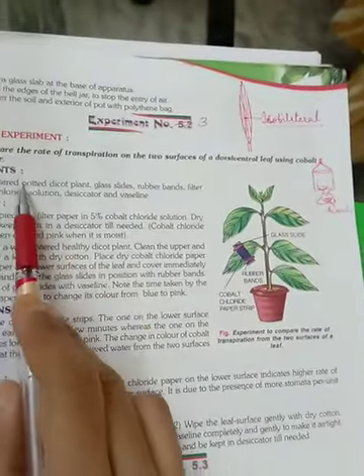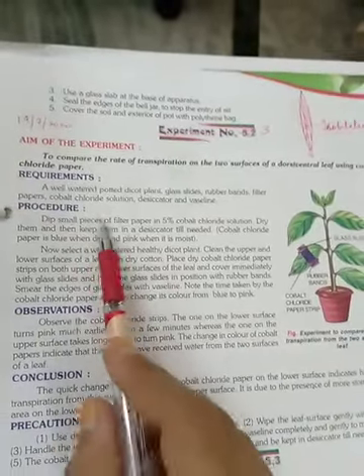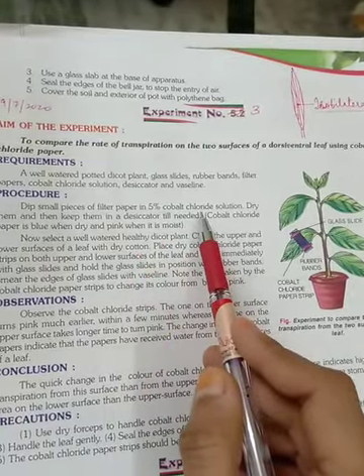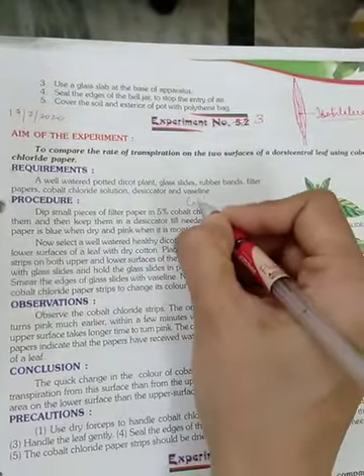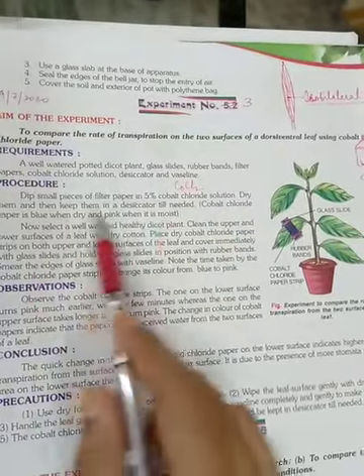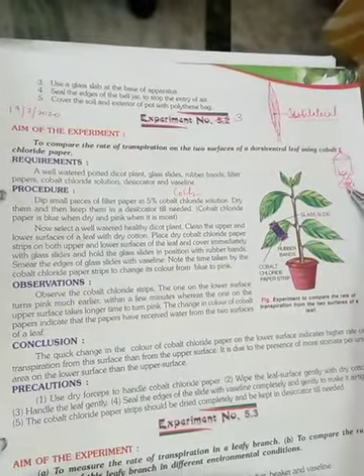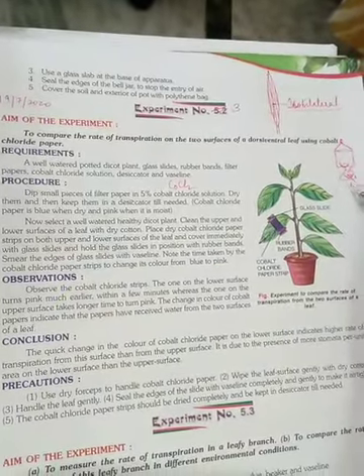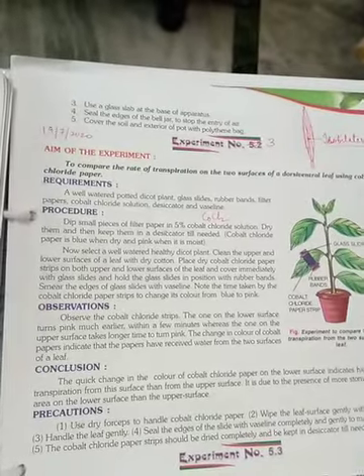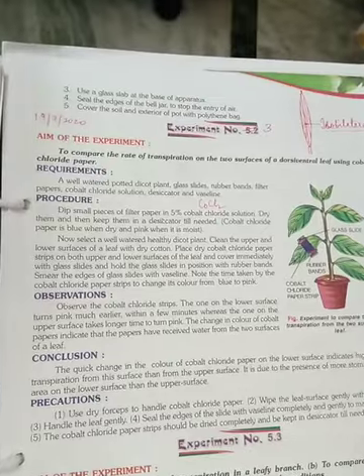Aim is clear, requirements are clear. Moving on to the procedure. Dip small pieces of filter paper in 5% cobalt chloride, CoCl2, solution. We'll dip the pieces, then dry them and keep them in the desiccator till needed. That is, it will totally dry them. So once the paper is dried, if brought in the presence of moisture, it might change color, but keeping it in the desiccator, it will be kept in a dry state.